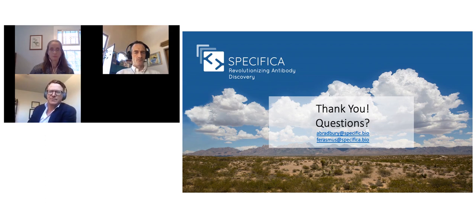The sequencing depth of PacBio for Sequel 2, so they came up with new technology, and this, to address earlier questions, has improved drastically. Sequel 2 gives you about 3 million overall consensus reads, and then this gets broken down, and based on how high you set it, you can obtain up to about 1 million sequence reads for VH and VL.